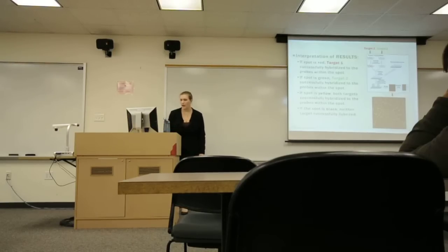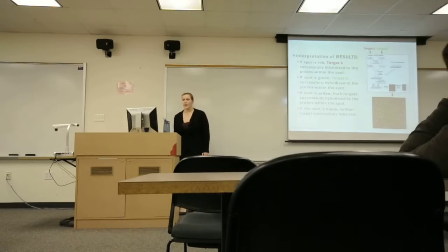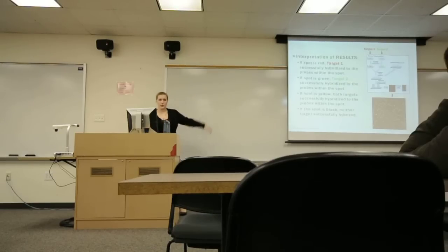Directly onto the slide. A little bit more into the interpretation of results of microarray. This would be like an example output. Let's call the left target 1 and target 2, for example.